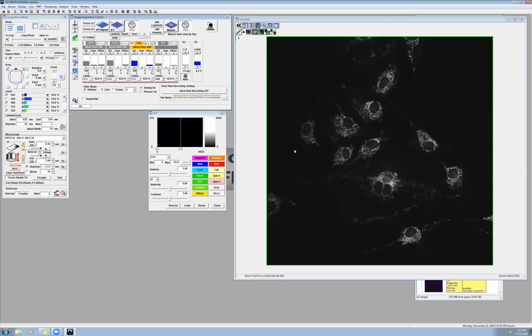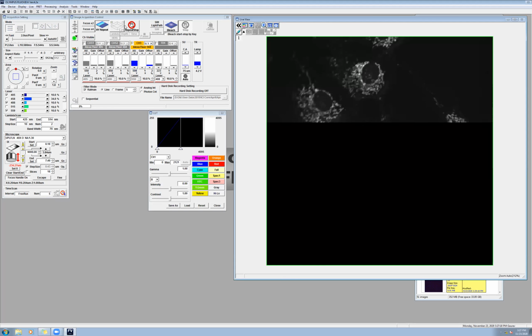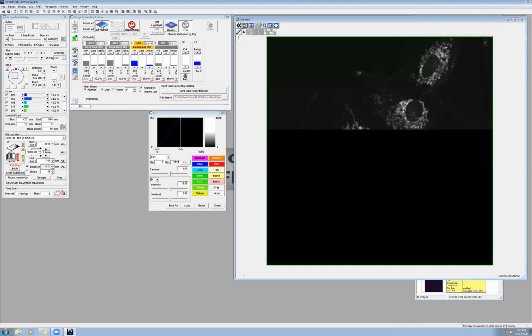But if you want to get the mitochondria and the structures even nicer, we can zoom in to a particular cell and focus on that. So let's look at how it looks in the center and do an XY repeat. Okay, so it looks a bit decent. Let's go over here. Okay, looks a bit decent.